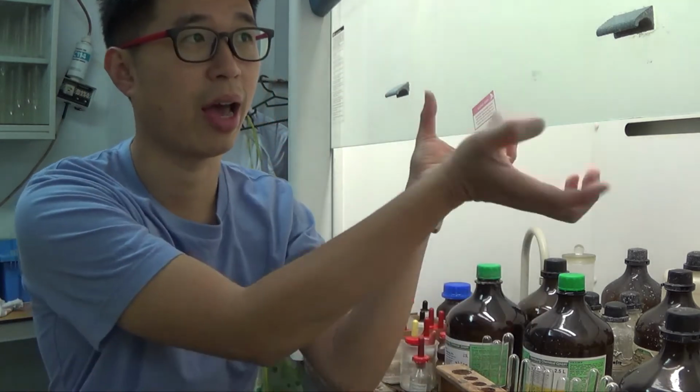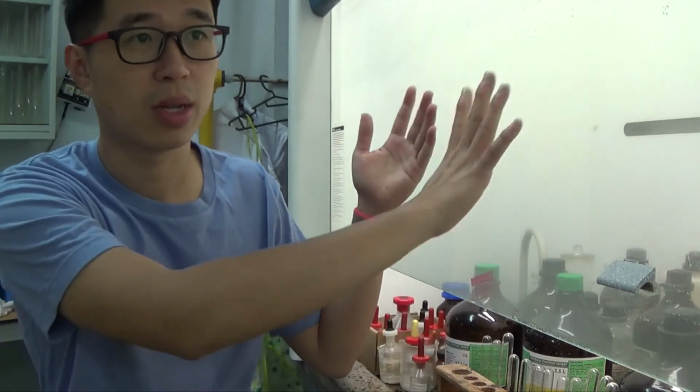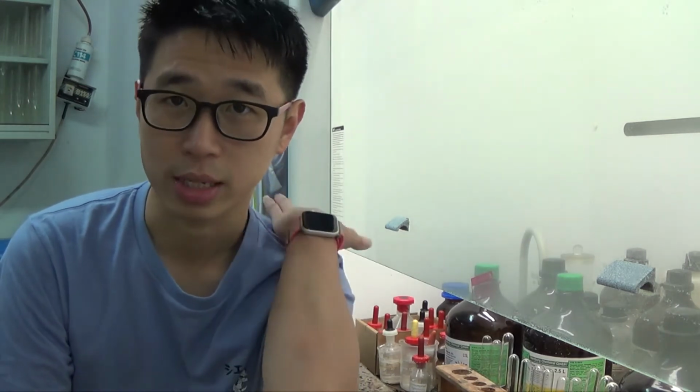Ideally, this is a fume cupboard where I have the sash. It's made of Pyrex or borosilicate, a kind of material that, even if something explodes inside, will protect my eyes. Ideally, I should have worn a lab coat and safety goggles. Those are very specific standard operating procedures, and they are not counted as additional risk assessments that you need to take, because those are standard in the lab. So lab coat and safety goggles are standard.